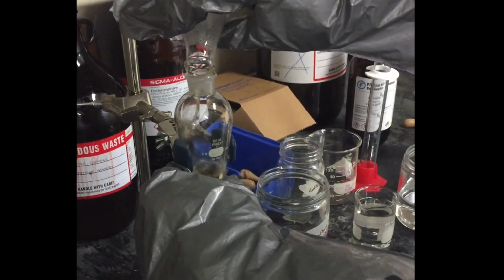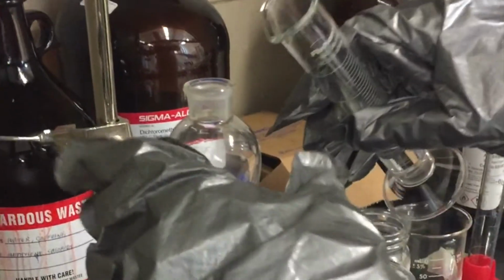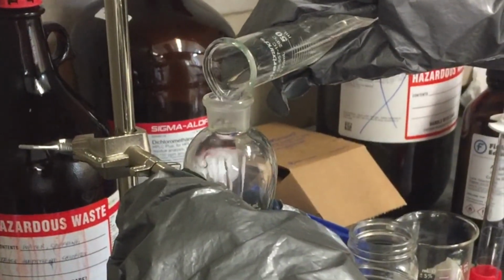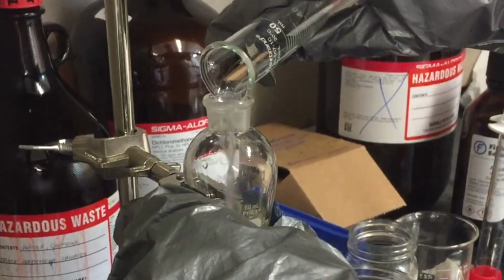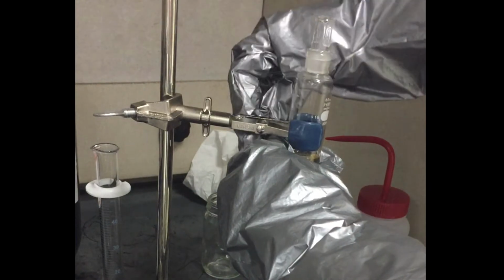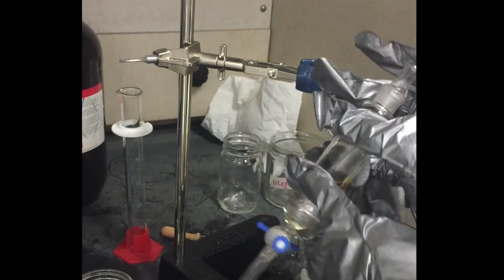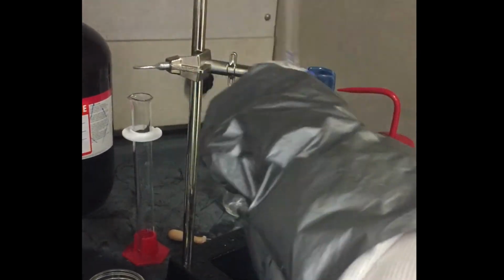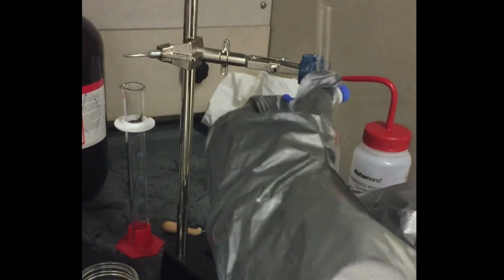First, the 15 milliliter sample is transferred into the flask. 15 milliliters of DCM is then measured out in a graduated cylinder and poured in the same flask with the sample. The flask is then sealed with the cap and removed from the ring stand. While keeping pressure on the cap, the flask is then inverted 3 times, making sure not to shake the flask, but rather just allow the phases to pass each other. Also note that after the second inversion, the valve is opened to release the pressure buildup in the flask.